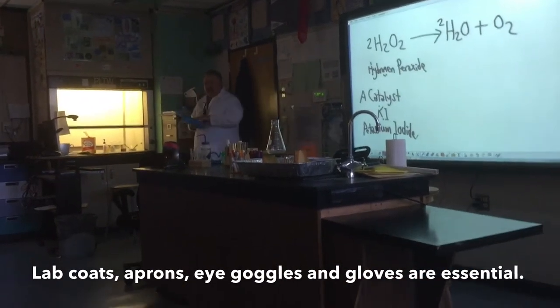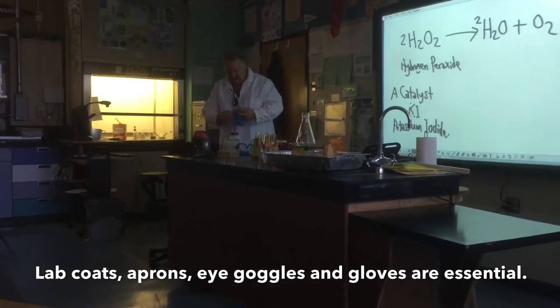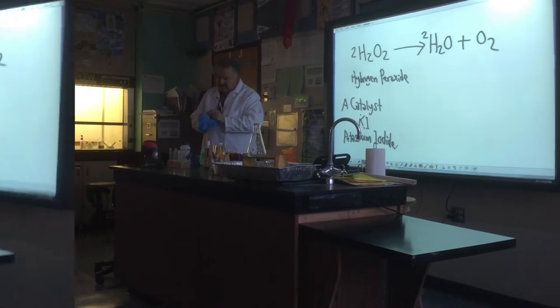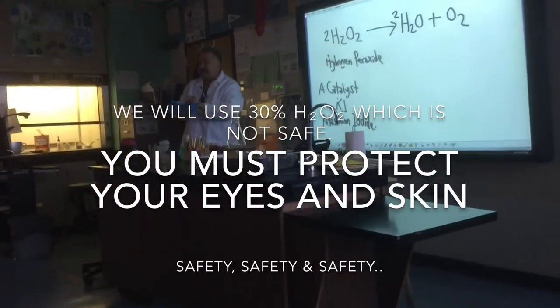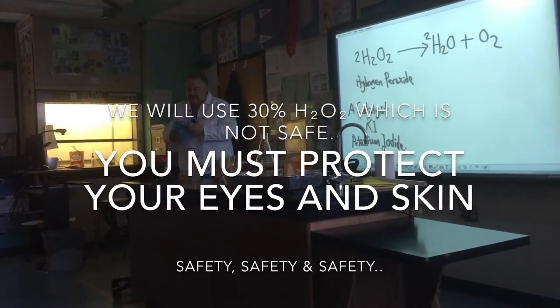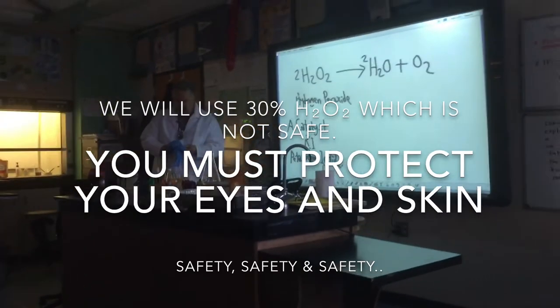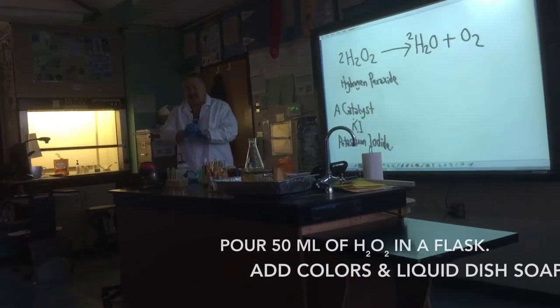All right, here we go. There are extra-large gloves for me. So what did I say about the molality or the concentration of hydrogen peroxide? How much? What did I tell you? 30, thank you. How dangerous is 100%? That's very dangerous. Chemicals in general are extremely dangerous.